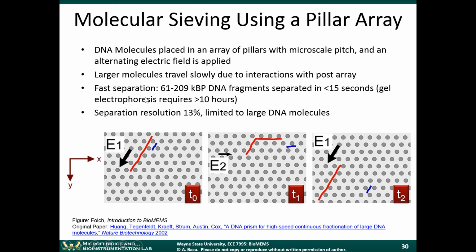Again, traditional gel electrophoresis requires hours. The downside of this is the separation resolution is sort of low. It's limited to large DNA molecules, but it nicely demonstrates that you can use microfabricated components as a stationary phase, as a sieving matrix, whatever you want to call it.